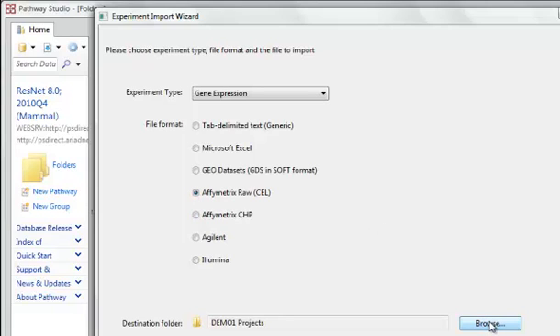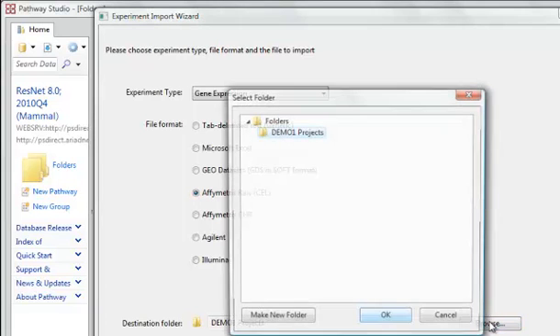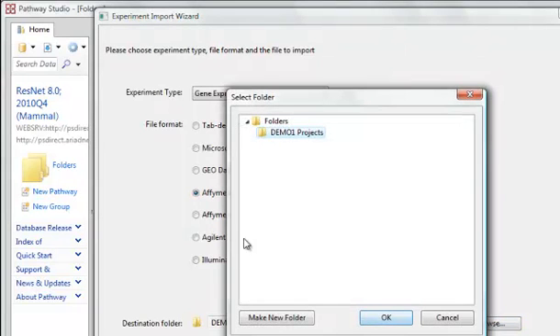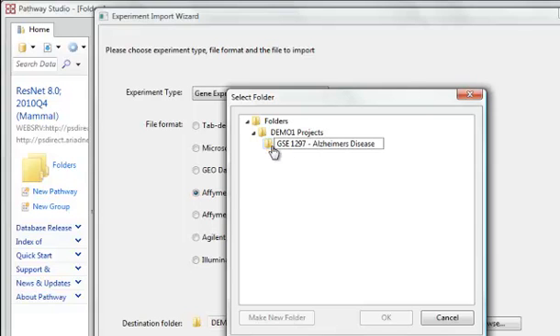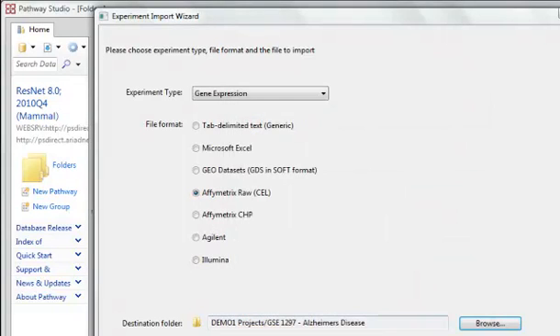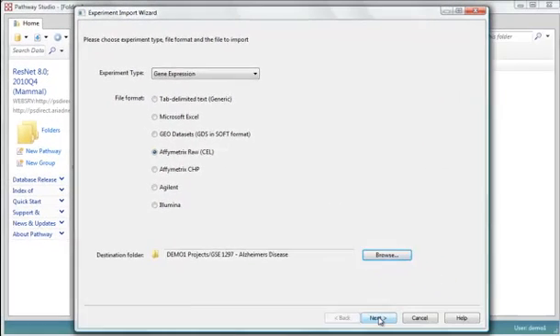Here I'm going to put these in a special folder on the Pathway Studio system. I'll make a new folder. I'll call that GSE1297 Alzheimer. That's where my data will be stored, and I'll refer to it in that location later.